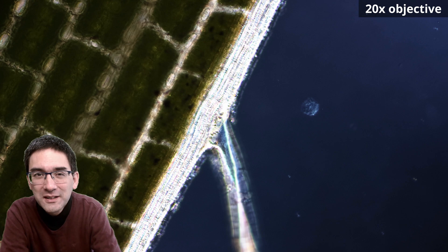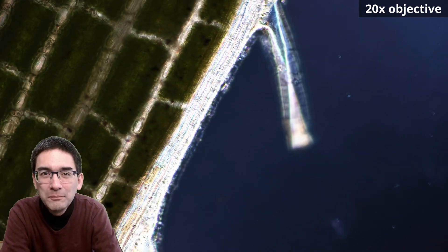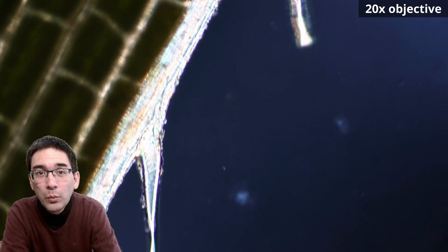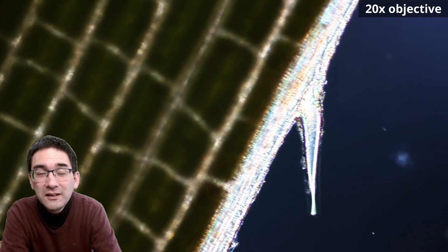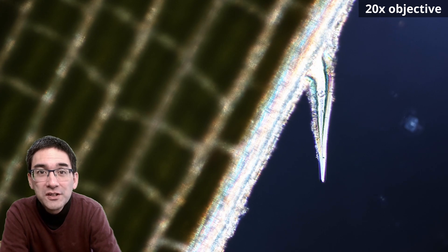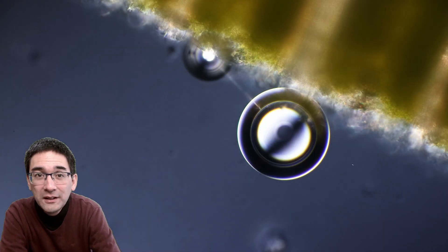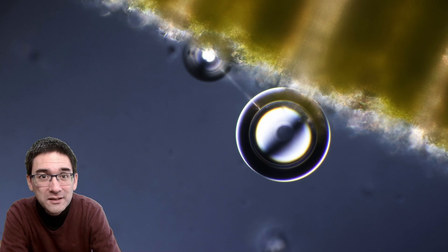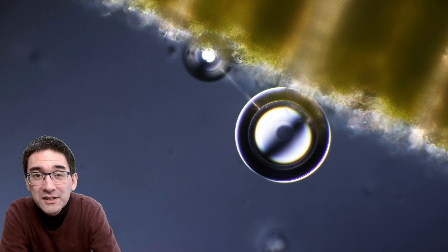There are some nice interesting spikes on the edge of the leaf as well, but those boxes you see — these are actually several cells together. The white lines are the vascular tissue, which is where the water is transported. So these are not the cell walls; rather, there are too many cells that are not visible because it's simply too green.